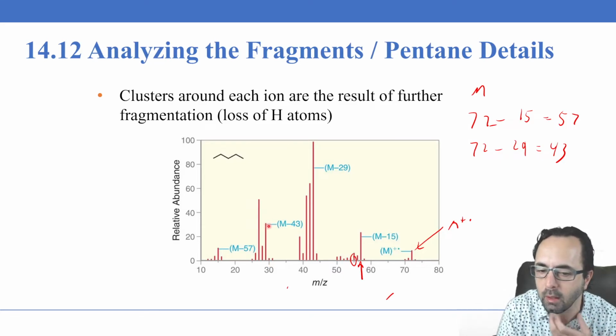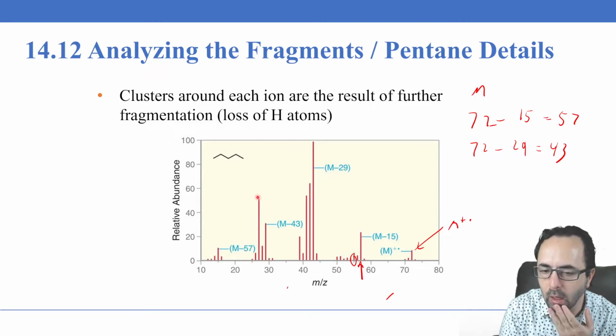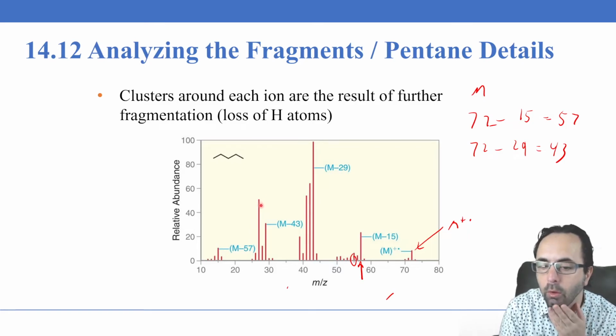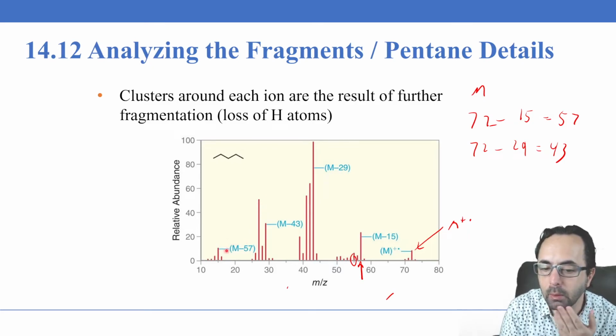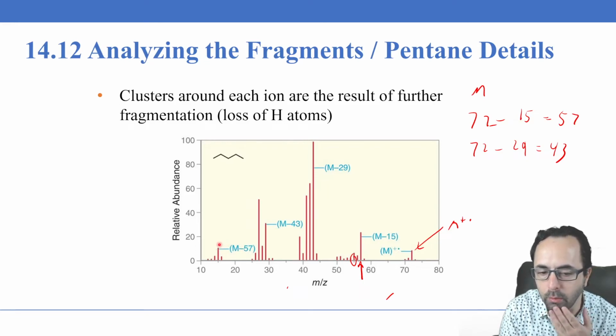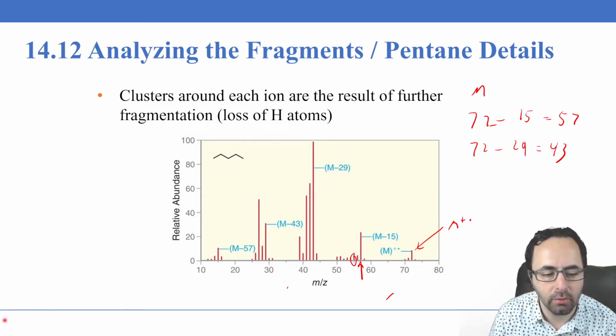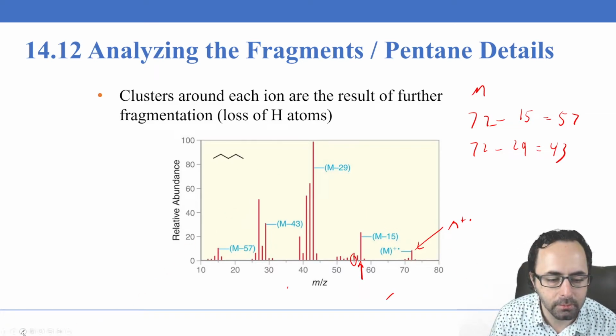And you'll notice something. That itself has had an elimination of 2 hydrogen atoms. And so that's something to think about as well. We'll be looking at that a little bit. So there's a significant amount of the elimination of 2 hydrogen atoms. Why is that? We'll think about that too. And then here we have the M-57 peak for that. That's for the loss of the butyl. And so after you've checked the molecular ion, you'll want to check for those situations there.